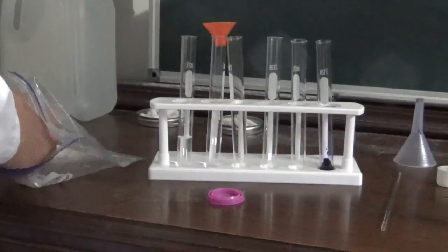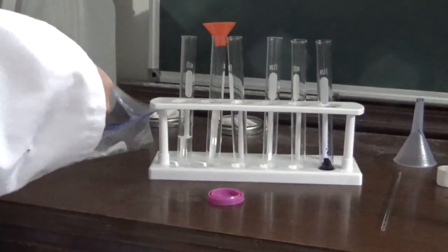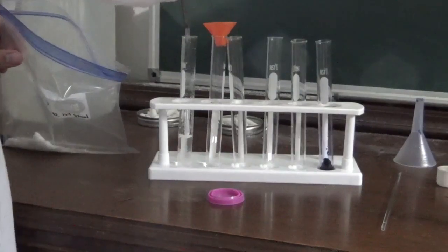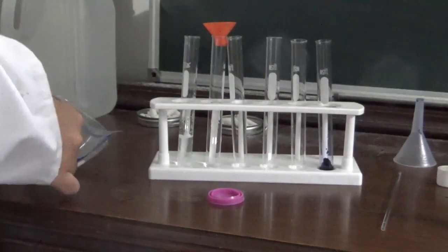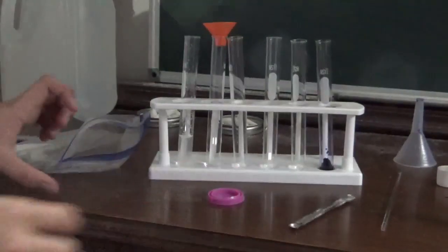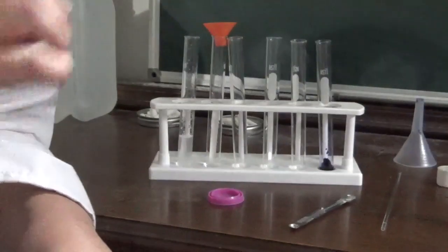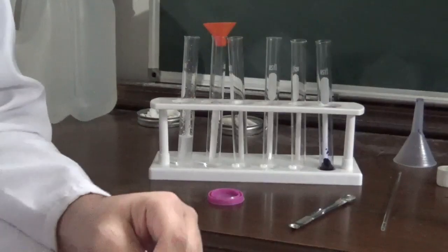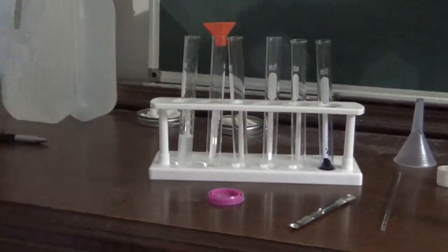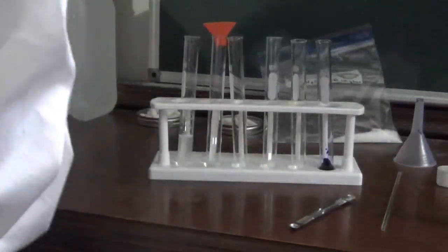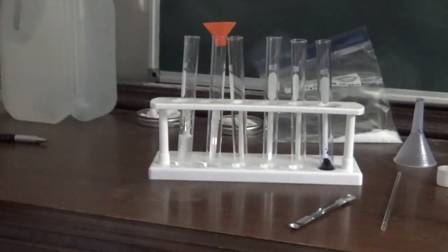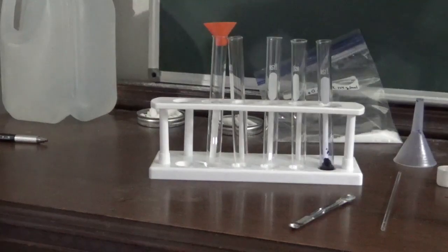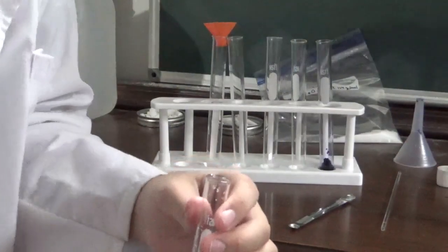And to this first test tube, I'm going to add some citric acid. Citric acid, of course, is one of the sour acids that you can find in a lot of fruits. So like oranges, for instance, have citric acid in them, and that's part of the reason why it gives you that sour flavor.